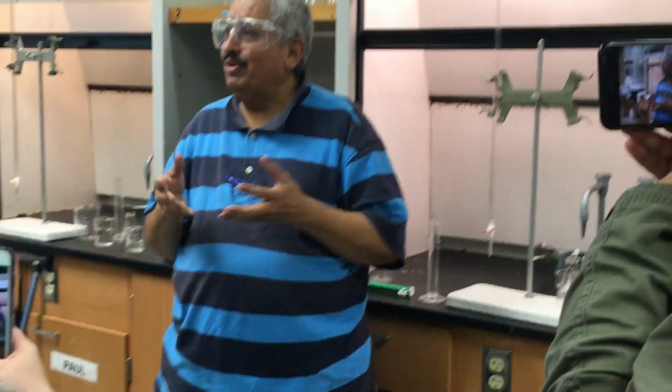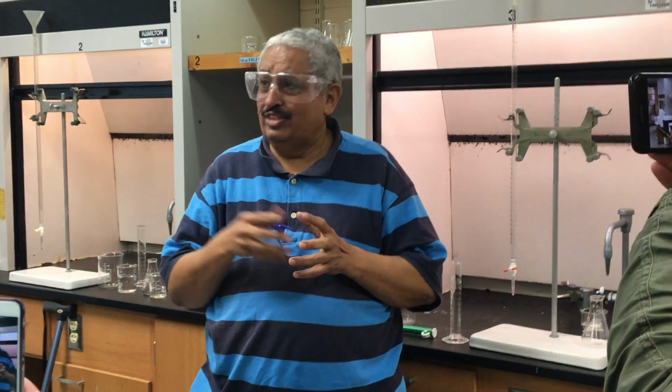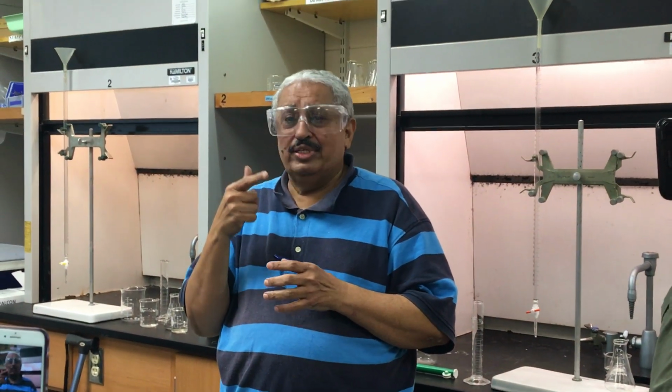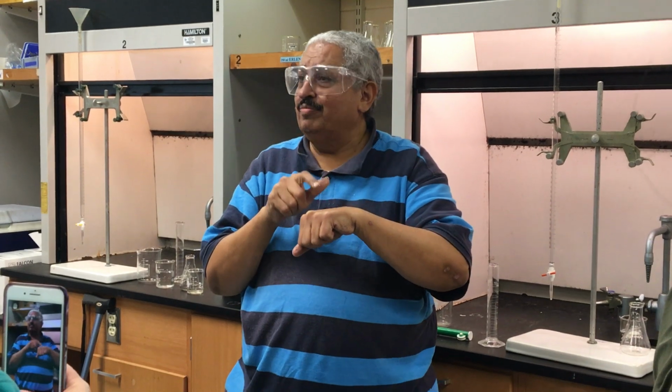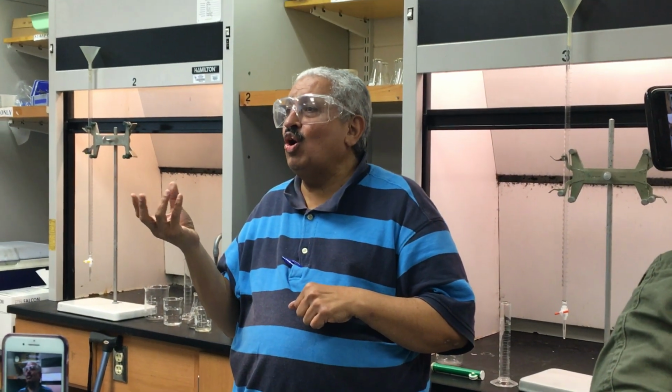Suppose I don't have litmus paper, and I have household items: Drano, sodium hydroxide, and vinegar. So how do I know that's the Drano? How do I know the acetic acid? Acetic acid does smell, correct? But the acid is stinging, and the base is soapy.